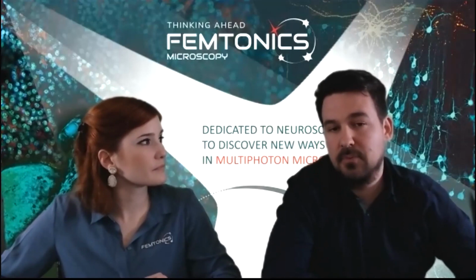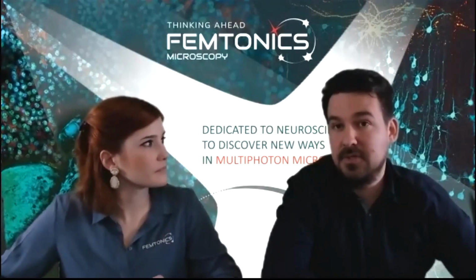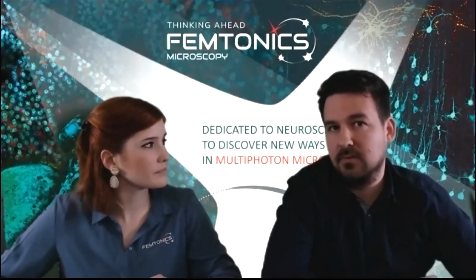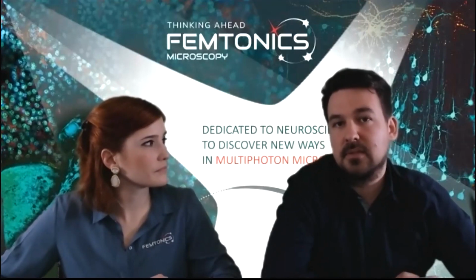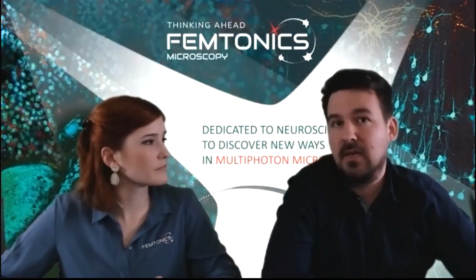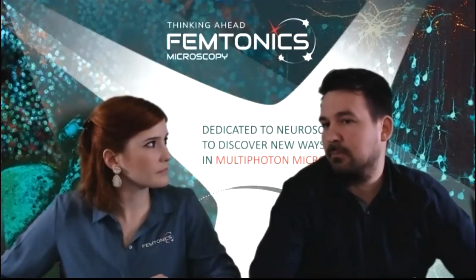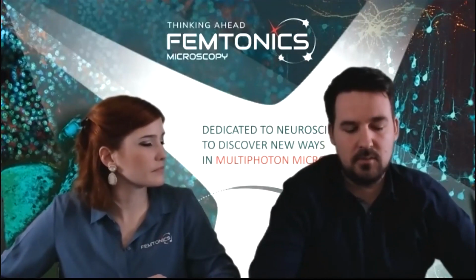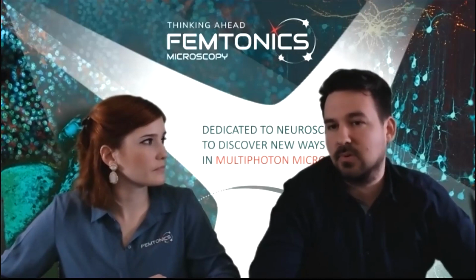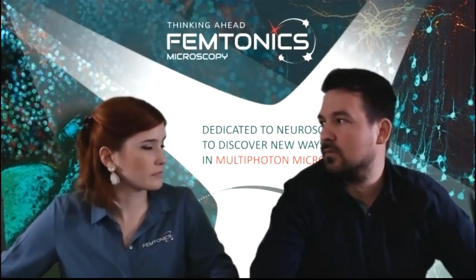If, for example, you want to do some nice anatomical images with the Galvo-Galvo, then you can. And after just a second, you can start your functional imaging with the Galvo Resonant. Moreover, you can program this as well, so you can build really nice protocols to repeat all of these things in a loop mode.